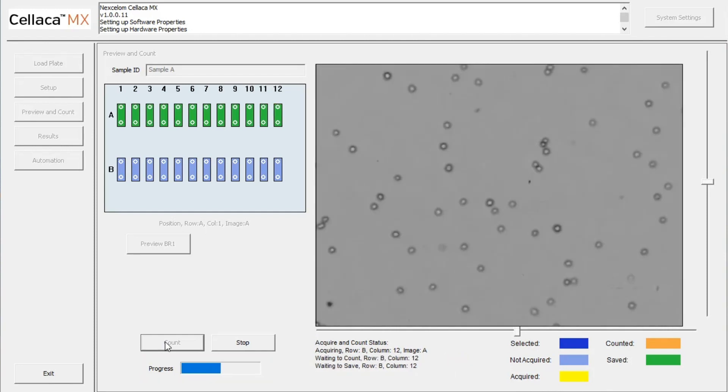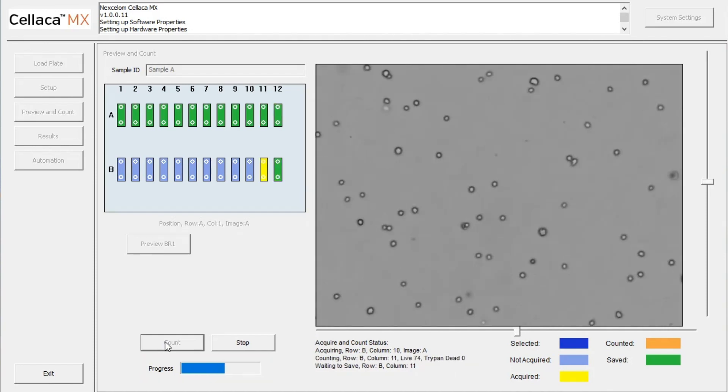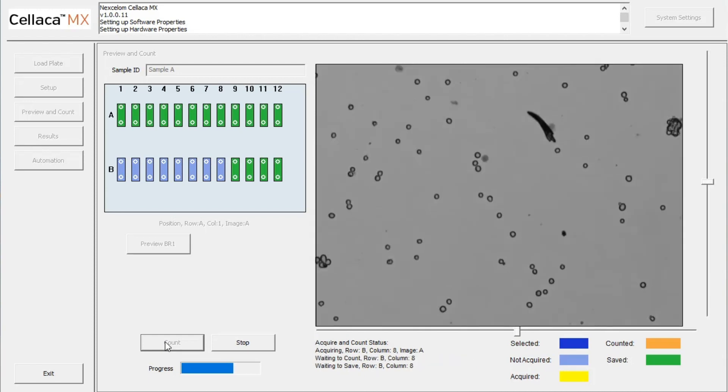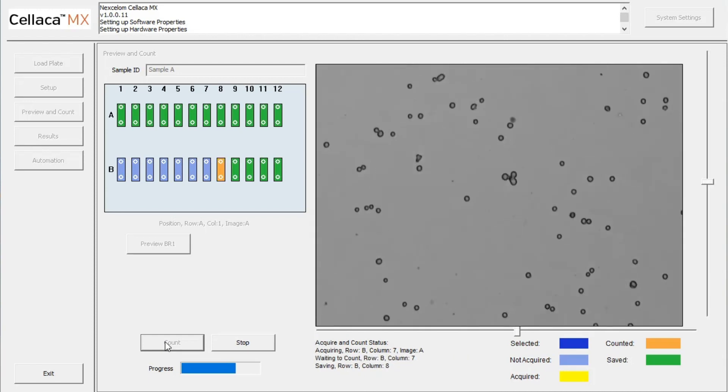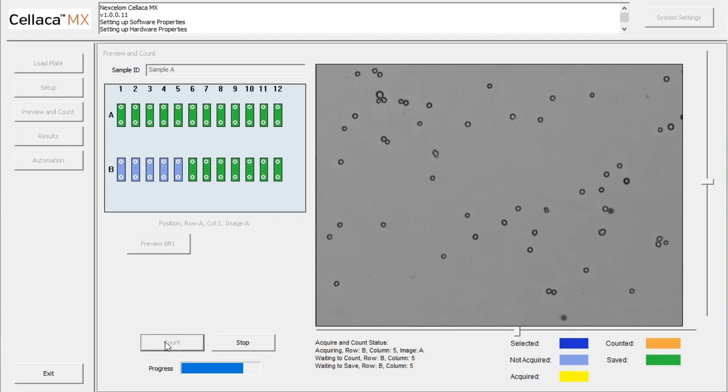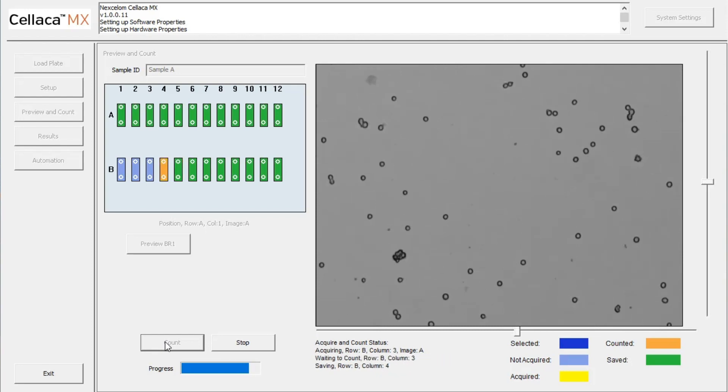Once the images have been acquired, counted, and saved, the graphic display for each data point will appear green. All of the acquired images, as well as the corresponding data, is automatically saved.